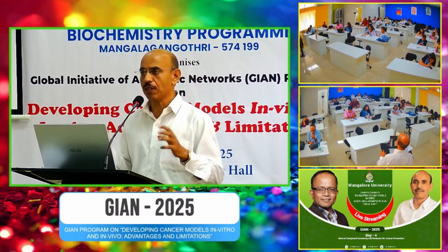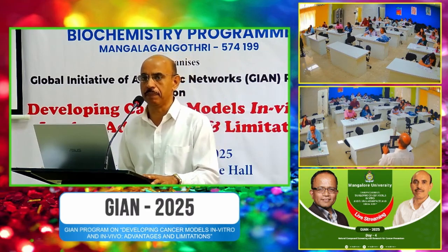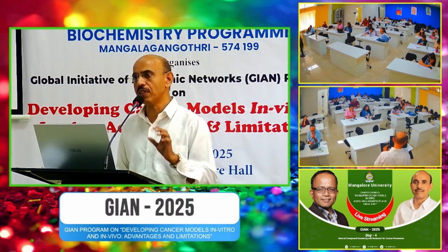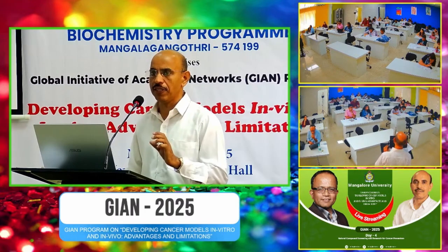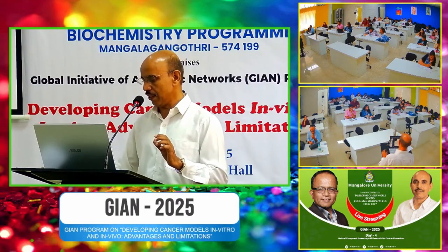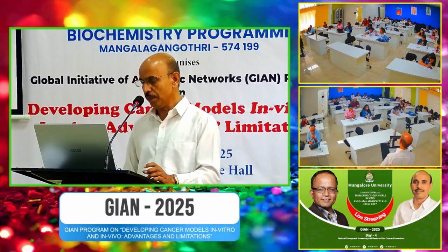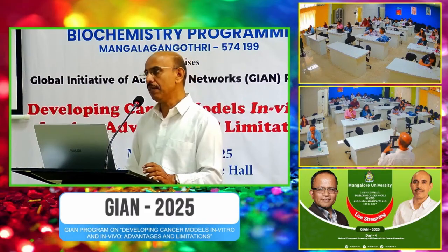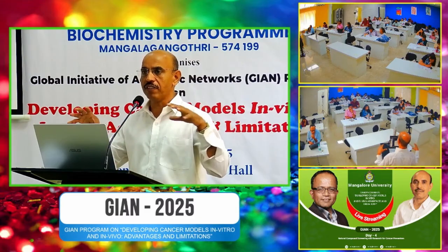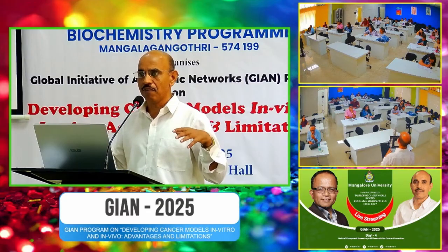Cells have to grow in the media. So if they have to grow in the media, we are supposed to give them proper temperature and conditions which favor the growth of the cells. Therefore, for that we need the incubator, and at the same time you need a waste disposal area, because whatever I am telling, you can observe in the cell culture lab, whether we have that kind of facility.